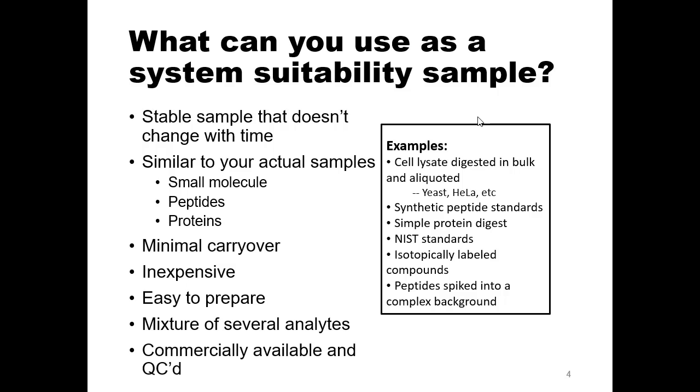In our lab, we're more interested in quantitative work than discovery work. So monitoring just a handful of peptides that are extremely stable and span the liquid chromatography range works well for us. But if you do some other type of work, like small molecule work, probably peptides aren't a good example for you. Our PRTC peptides are spiked in at a concentration that we should always see. I think we're loading 150 femtomoles on the column. So that should be a screaming signal that should never be missed unless terrible things are happening to the system. Are there any ideas that you have for samples you might use?